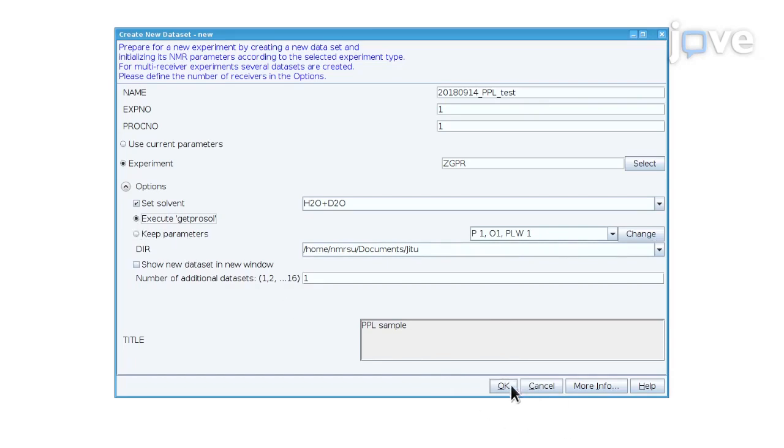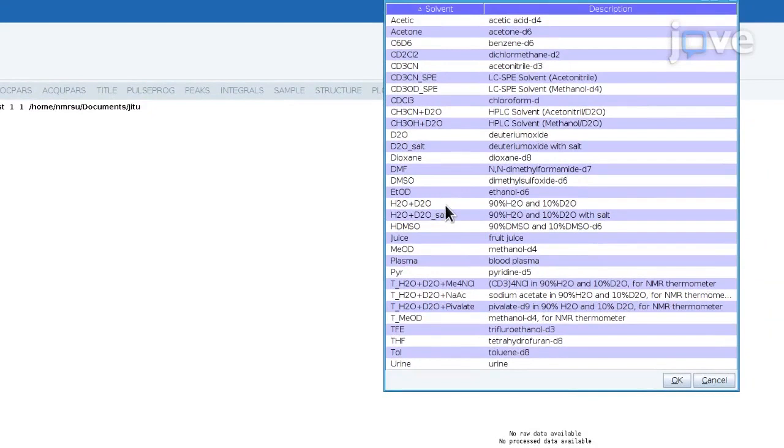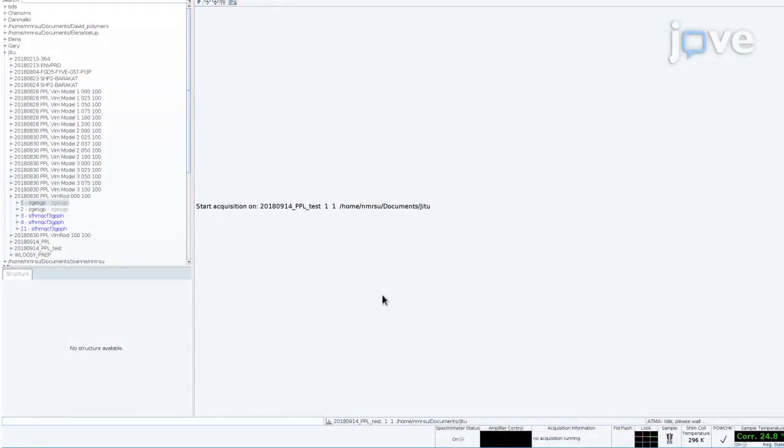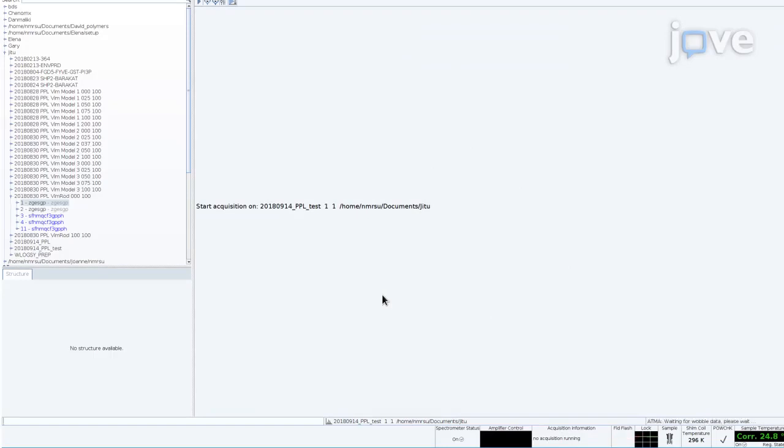and solvent-dependent parameters. Lock the sample to the deuterated solvent using the lock command and wait until it is finished sweeping and achieves lock. Correct the resonance frequency of the magnet by tuning the sample using the automatic tuning command ATMA. Monitor the wobble curve until the automatic tuning is complete.